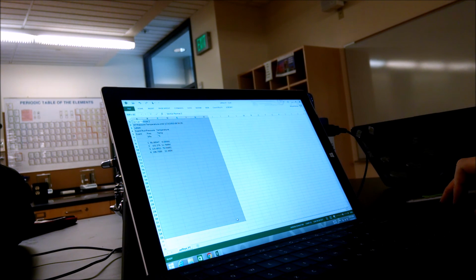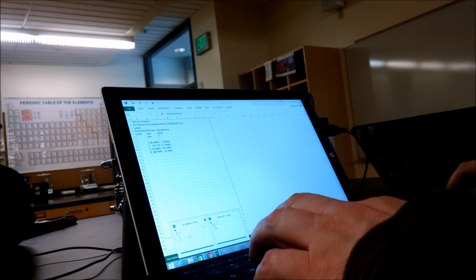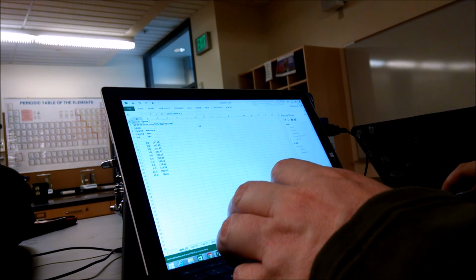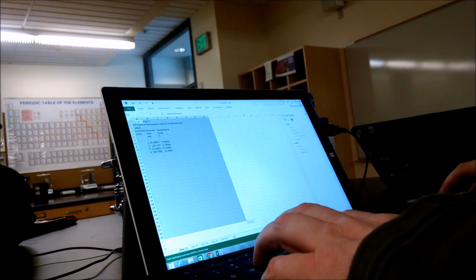Oh yeah, that's what I was doing just now. I thought that's what you said, but I was ahead. Okay, copy, and then now I want the other file that we were in, the PT one, and I'm going to paste the data. Wait, the data starts at number 8, right?